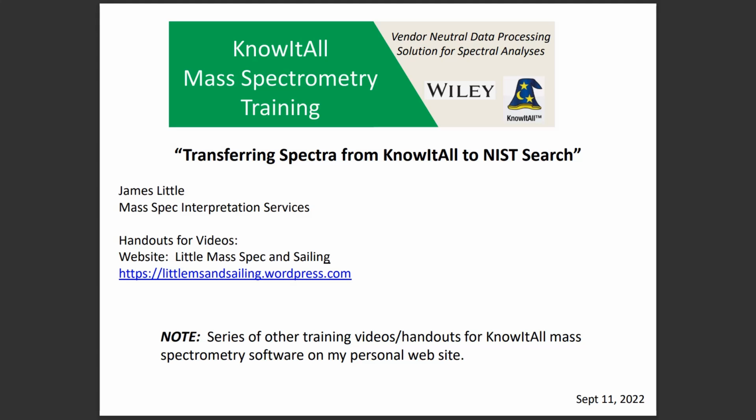Wiley has introduced new Mass Spec capabilities within their KnowItAll software. KnowItAll is a vendor-neutral data processing solution for spectral analyses. I have created a series of these training videos for the software which can be found on my personal website. Today I will be sharing a video entitled Transferring Spectra from KnowItAll to NIST Search.